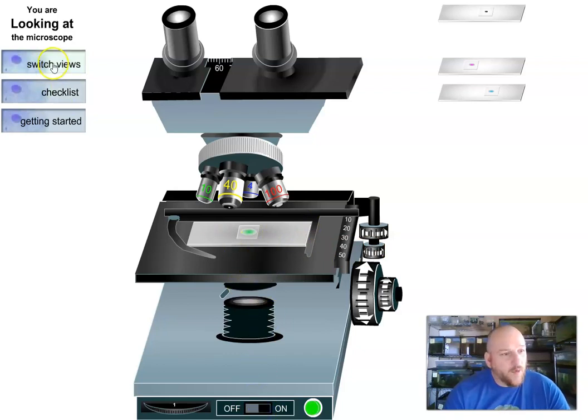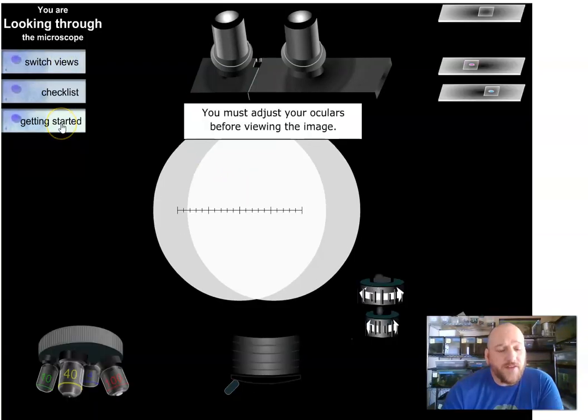And there's this switch view thing here where we can see what our view looks like in a different circumstance. It's not terribly clear but right now the four times objective is facing the scope so that's what we're seeing. So we're going to switch views here. Since this is a binocular scope.